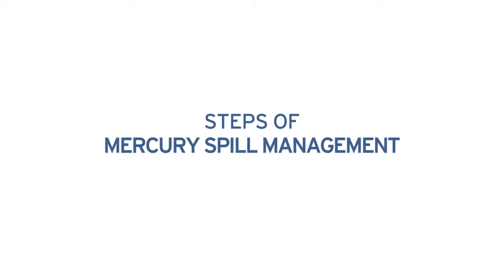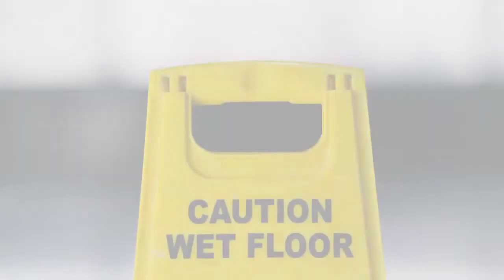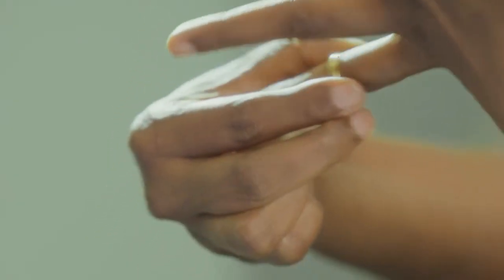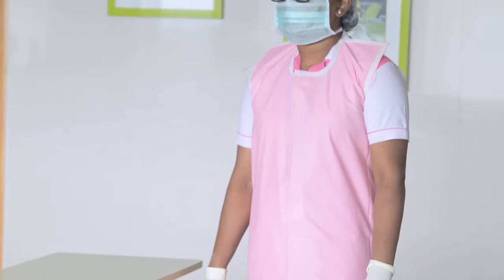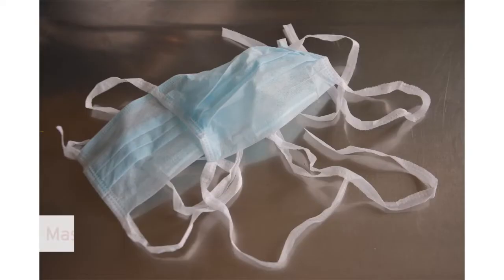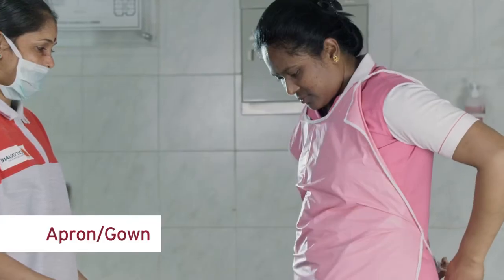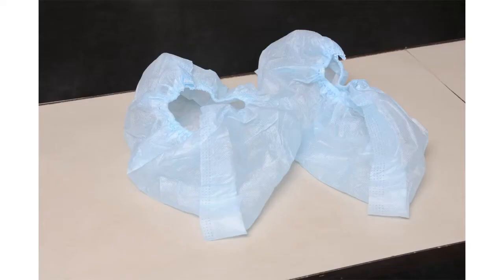In the event of a mercury spill, follow these steps: place a caution board and cordon the area. Remove all jewelry and wear personal protective equipment like face mask, gloves, apron, and shoe covers. Do not use vacuum cleaners or brooms to collect any spilt mercury.